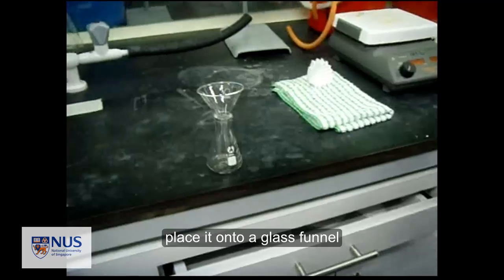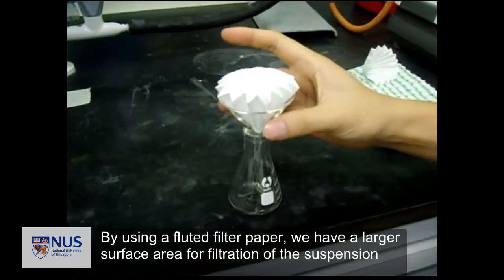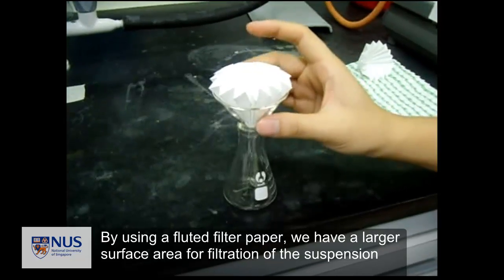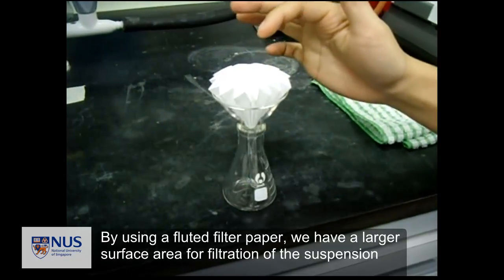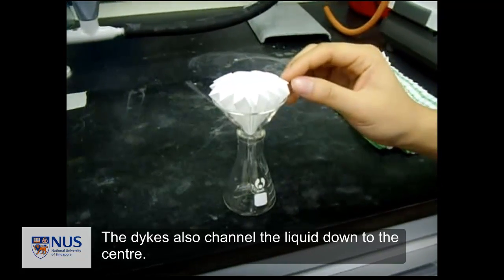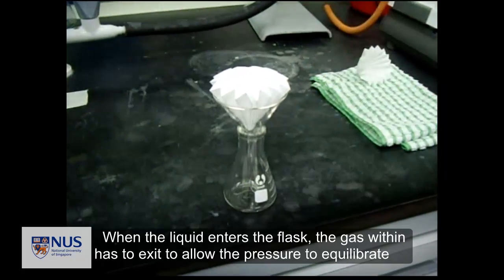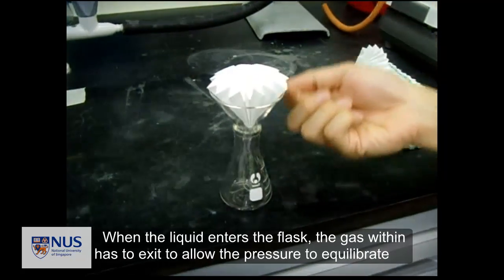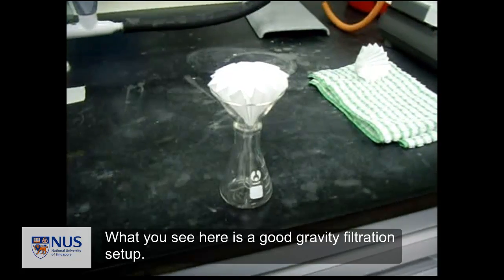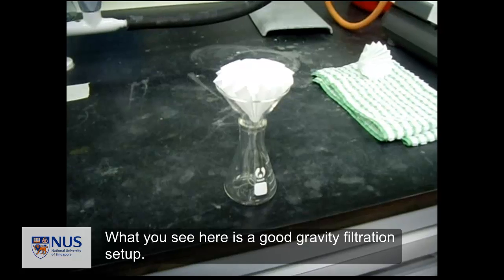Then you place it on top of a filter funnel. By using a fluted filter paper, we have a larger surface area for filtration of the suspension. The pleats also channel the liquid down to the center. When the liquid enters the flask, the gas within has to exit to allow the pressure to equilibrate. What you see here is a good gravity filtration setup.